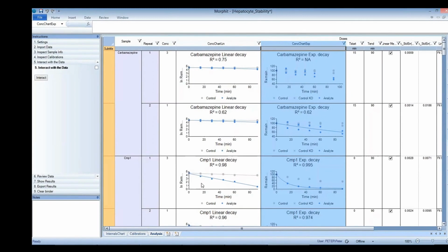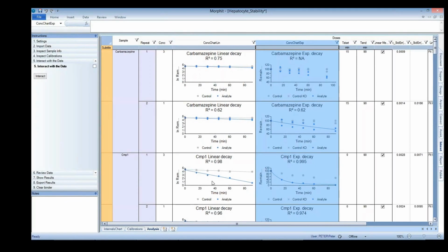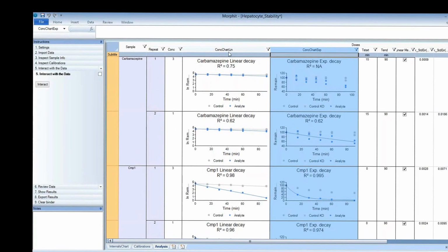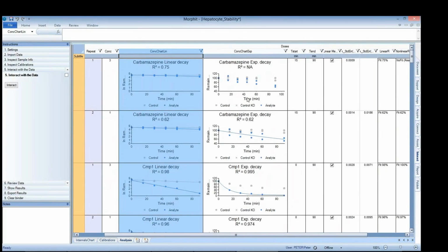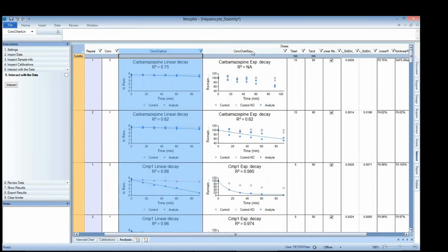And that is just because the variance of this is homoscedastic, where you have equal variances at every time point. Whereas in this model, it varies. The variance will be larger at this high point than here. So this is often the preferred model when you talk to a statistician. But nevertheless, it could well be that you have a preference for this, for instance, because your R squared is larger. You see in this case they are equal. In this case it's slightly larger, then you prefer this one. So you have full control whether to use this or this model.